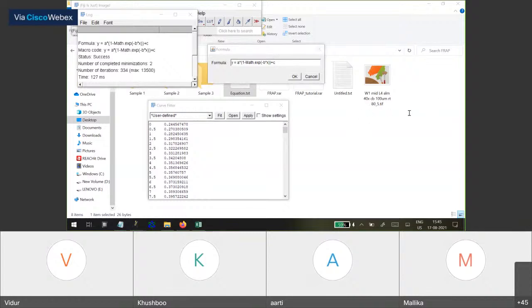And the second, which is, can you please explain it once more? Where do you want me to explain from? Can you just let me know where your confusion starts from? From where you got the formula in Fiji. Okay.